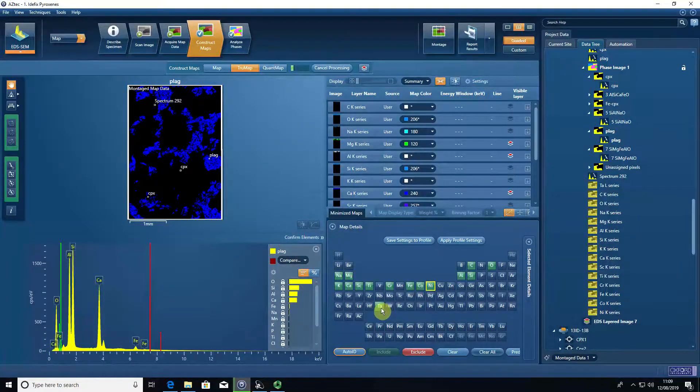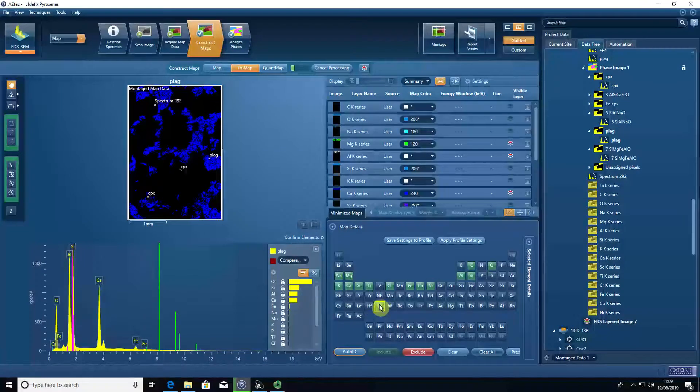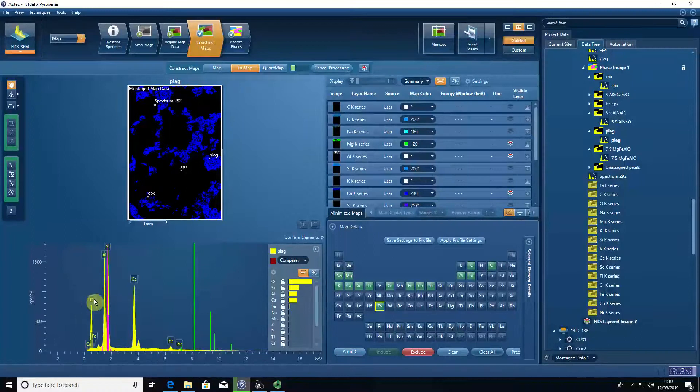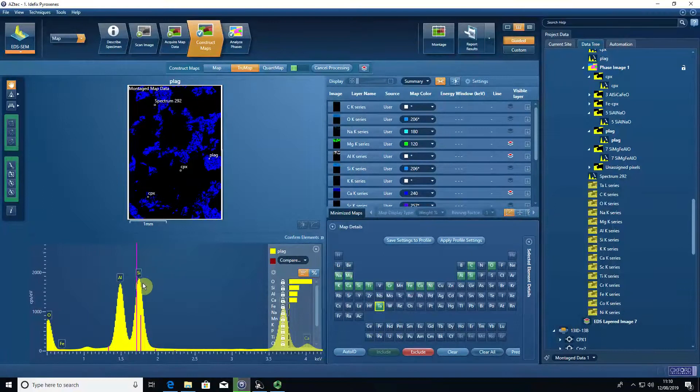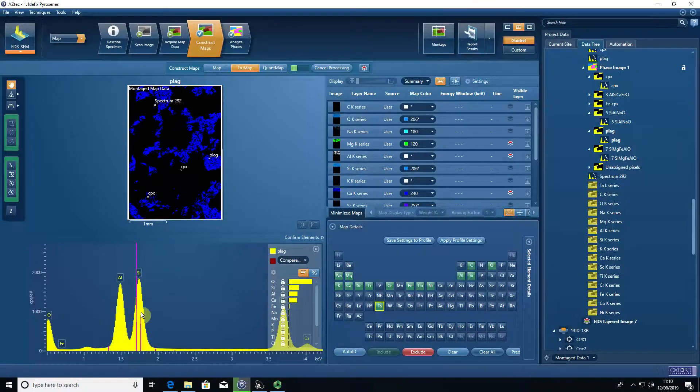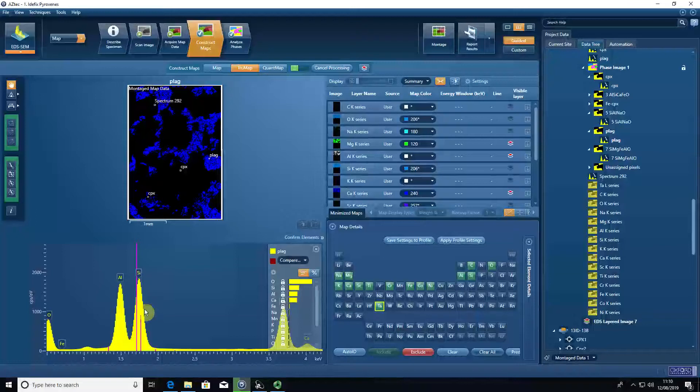High concentrations of tantalum - this is purely forming from an overlap with silicon. It's a common occurrence. The software has tried to identify all the elements and it's seen a bump at silicon and thought, well, maybe I can get some tantalum in that bump as well.